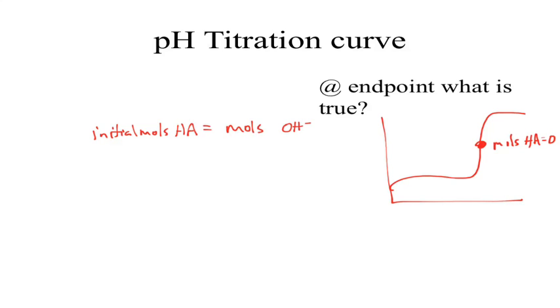Can we determine the moles of base added? How do we determine the moles of base added? What do we know about our base? We know the molarity based on our standardization, which was at 0.7. So it'll be roughly 0.7 moles per liter. Oh, that's molarity. We want moles. So what do we need to get rid of? Liters. How do we get rid of that unit? Multiply by liters. But what number do we do there?